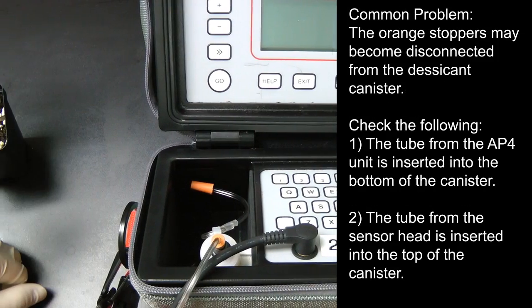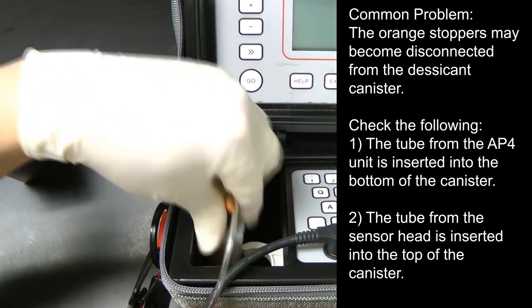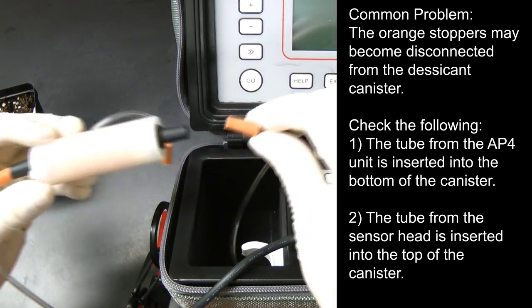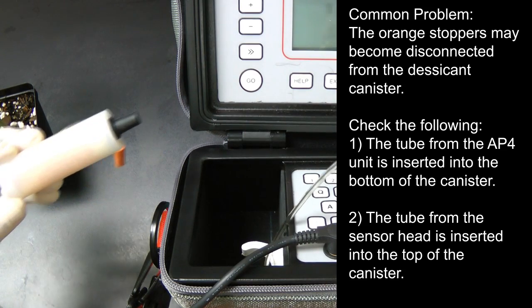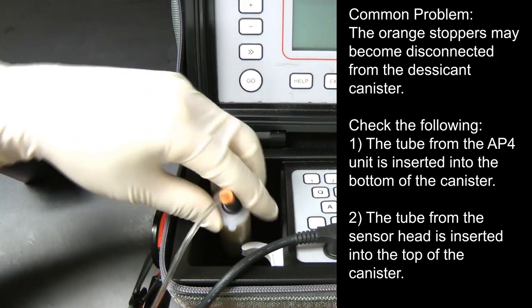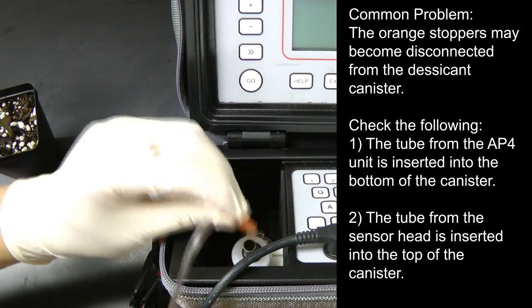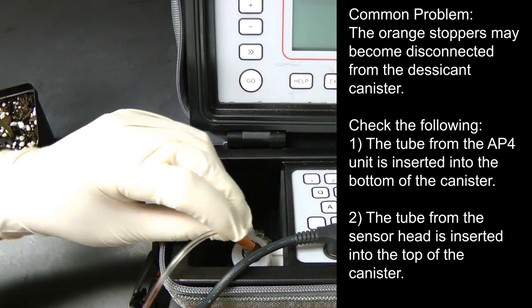The orange stoppers becoming disconnected from the desiccant canister is a common problem that you may encounter. Check the following: First, that the tube from the AP4 unit is inserted into the bottom of the canister. And second, that the tube from the sensor head is inserted into the top of the canister.